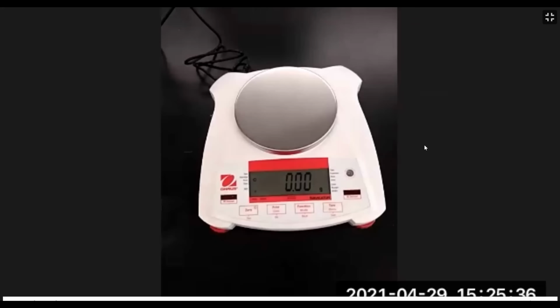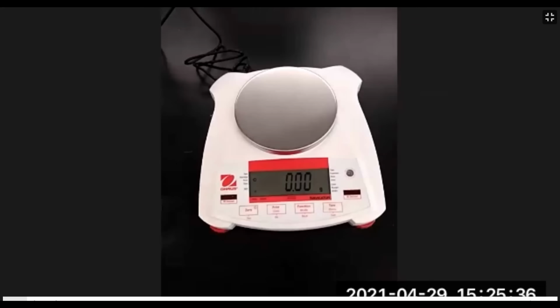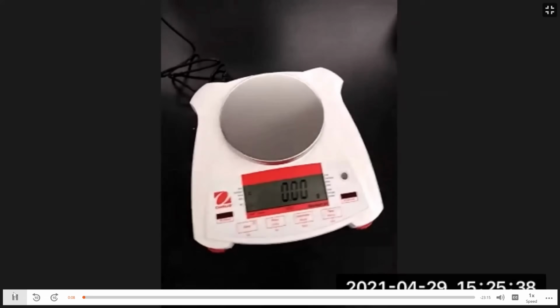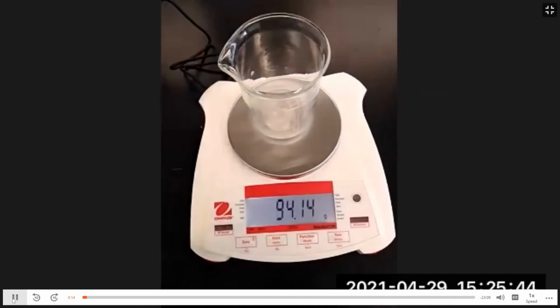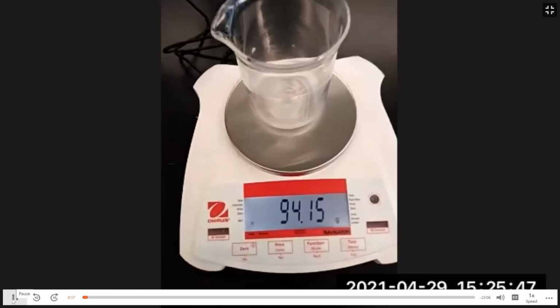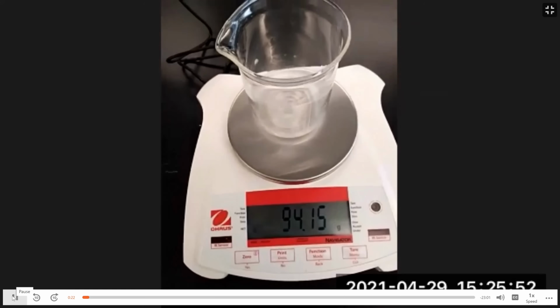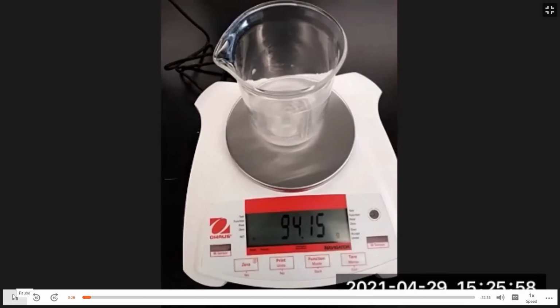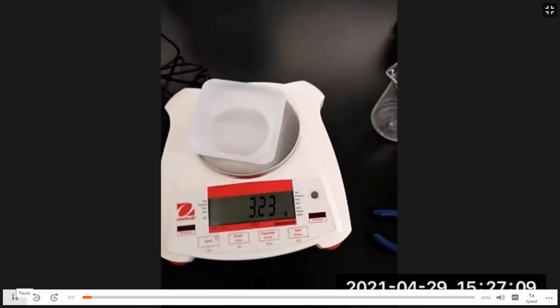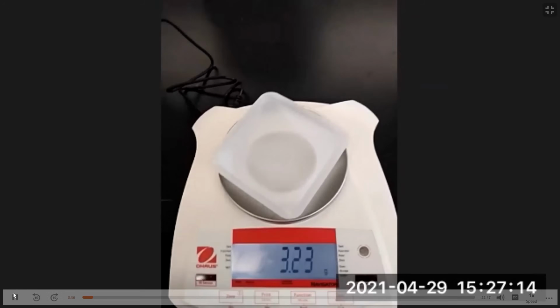So the first thing we want to do in this experiment is to weigh out our copper. Again, in the lab, it'll tell you how much copper metal to weigh out. So that's what we're doing here. Make sure your balance is tared, zeroed out.